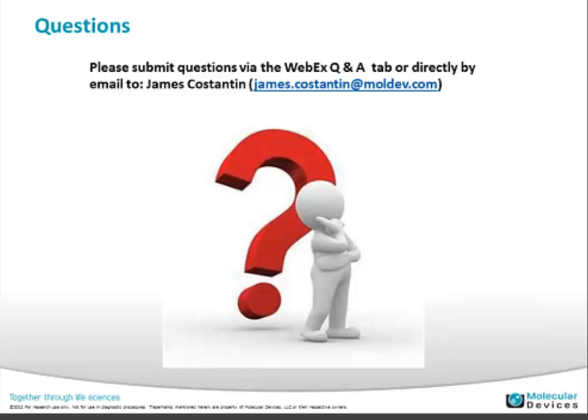Okay, thank you. And last question, how does the iFlux complement your assay portfolio as a CRO and ion channel services provider? So it fits in very nicely in between our IonWorks and our Patch Express and soon to be Q Patch. It's obviously not going to quite match the throughput of, say, an IonWorks in a screening mode, a single concentration. But in terms of doing the type of assays that, like I just showed, the GABAA assays, and generating those responses, it's going to have much better throughput than, say, the Patch Express.